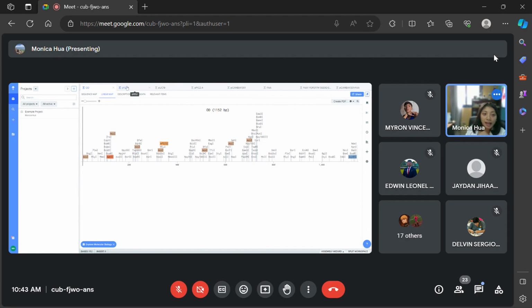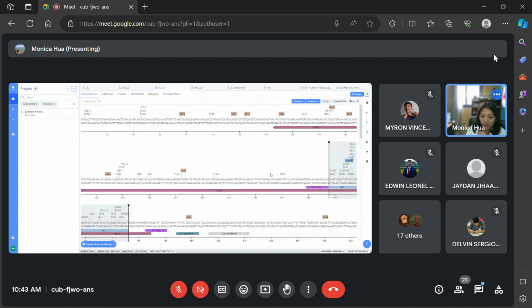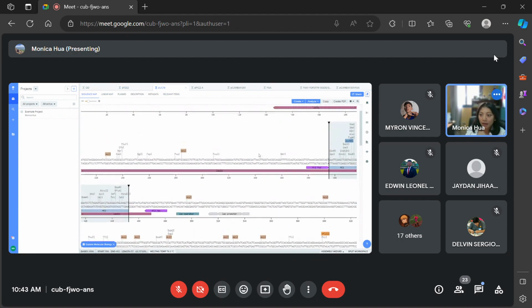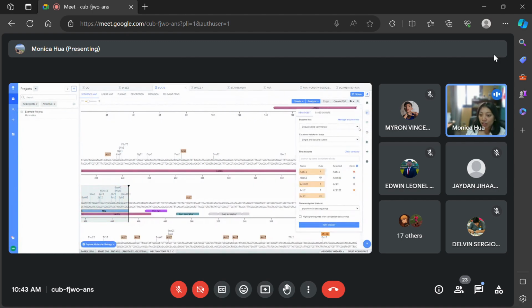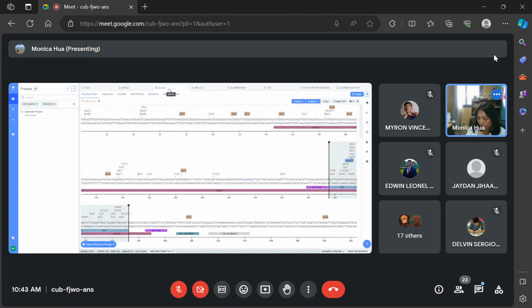And you go to each of these vectors. The exercise is for you to look at the restriction enzyme sites on the vector, and you have to make sure that the restriction sites on the vector are not in your OD sequence. That's going to take you a while.